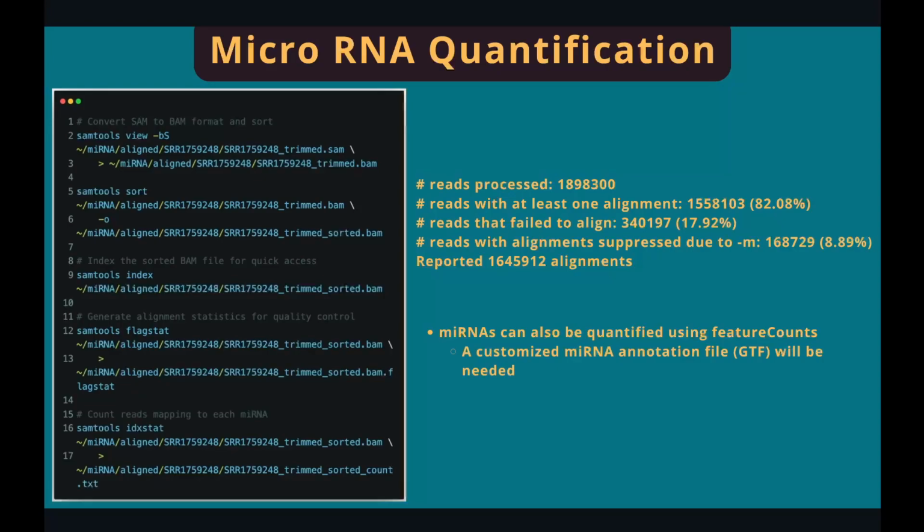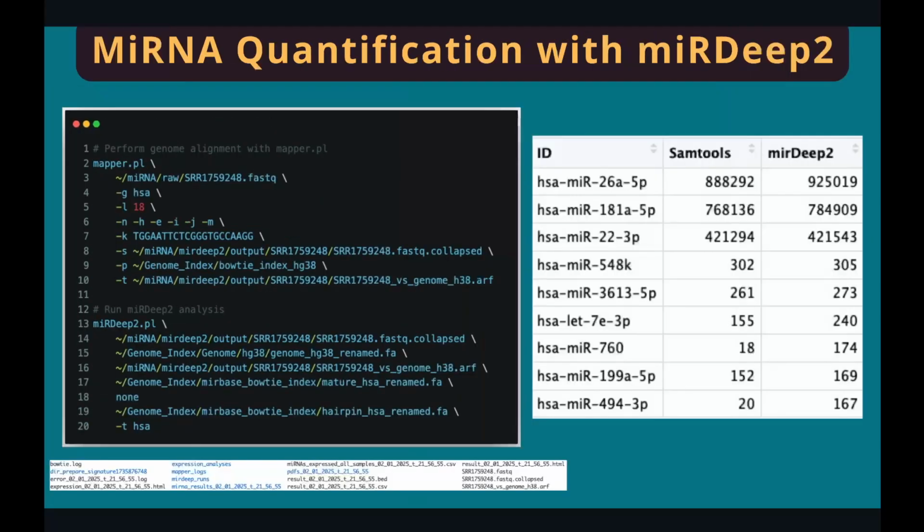As I said before, as a programmer, we want to be as lazy as possible. If things get too complicated, maybe there's another way, a simple way to do it. So next is a simple way. Method 2. We're going to use miRDeep2 to quantify microRNAs in 2 steps.